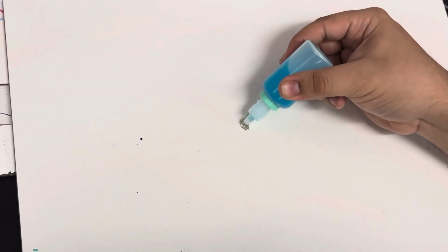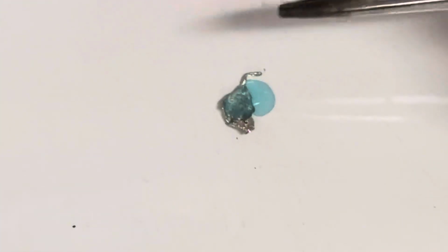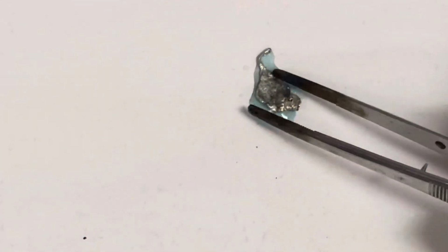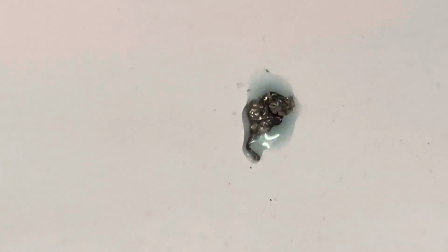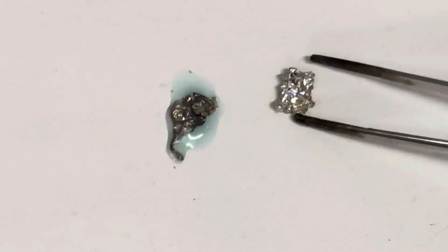You can see that familiar blue color of the copper ions. As it sits on that tin, those copper ions are going to steal the electrons from my tin, suggesting that tin is not strong enough to hold on to its electrons. We can see some of that reddish brown color already. Flip it over and we can see further discoloration on our tin. And of course that discoloration is actually copper that's forming.